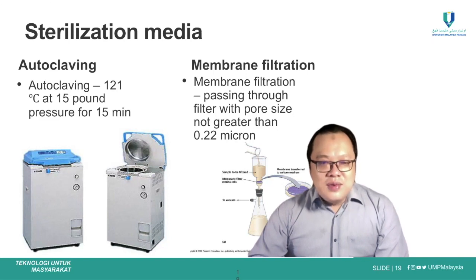This enables us to kill all those bacteria and fungi and the endospores of the bacteria. This method will ensure that no microorganism will be able to grow after the sterilization. Usually this type of prepared media, we can store for a very long period of time because there are no microorganisms alive in the media.